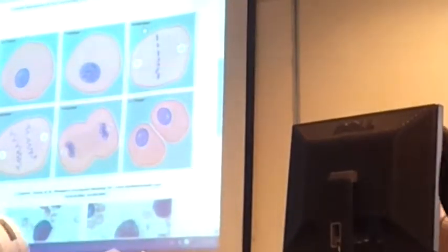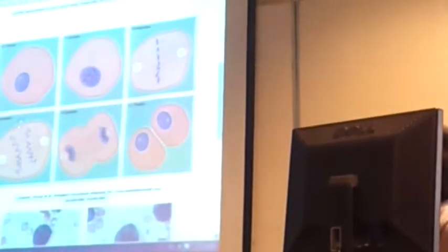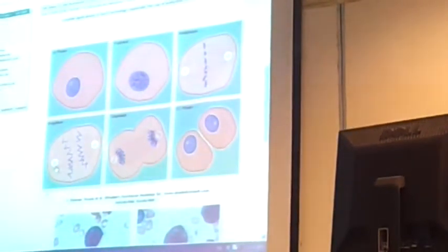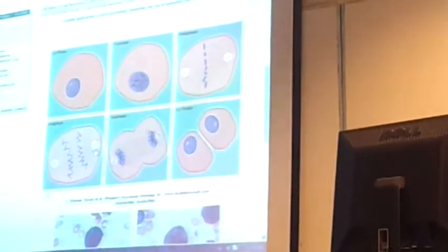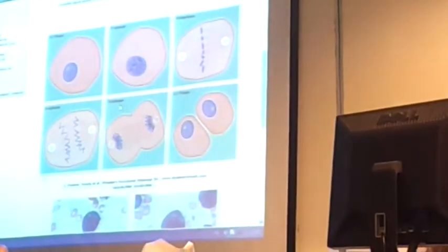Therefore this is mitosis. In anaphase, each chromosome splits into two - half moving to one side and half to the other. Then the chromosomes have completely moved and cell division has started. This is telophase, and this one cell has now become two cells.